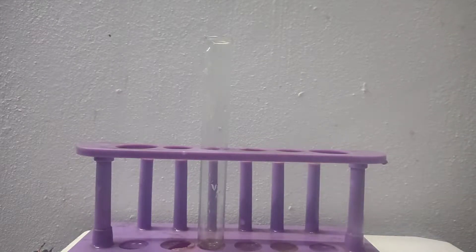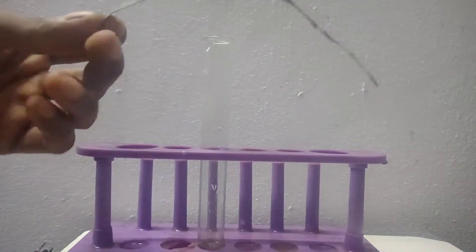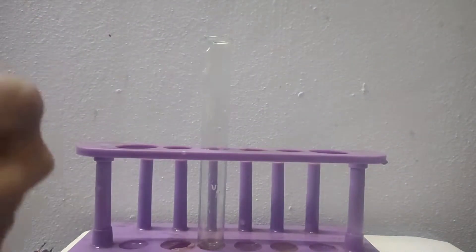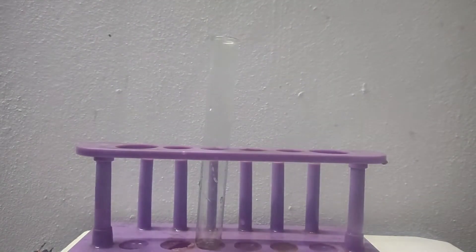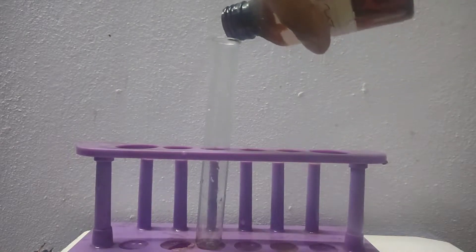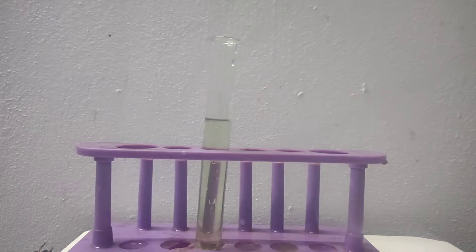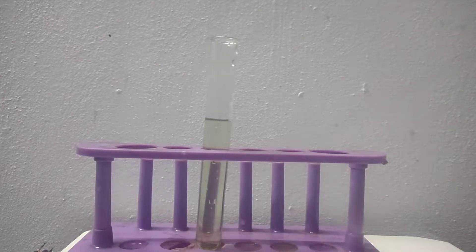In this video I will be making zinc powder from electrolysis. I am using zinc strips obtained from a dry cell in a previous video. In the test tube I am going to fill zinc chloride solution. I only had this much zinc chloride solution and I am not going to dilute it because we need a concentrated zinc chloride solution.